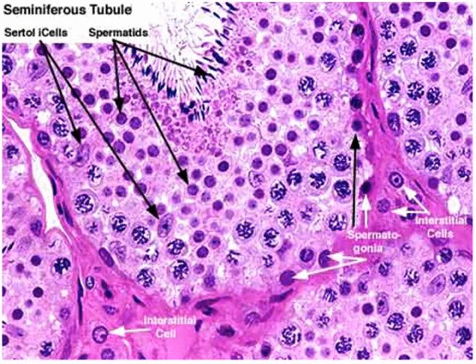Okay, so if I'll erase this, I think what I'll do is just draw a blue line around the boundary of one of these seminiferous tubules. So there's one, and then here's a little piece of another one. So all of this lighter purple, that would be where seminiferous tubules are. And then in between, in the darker pinkish purple area, would be the interstitial spaces.